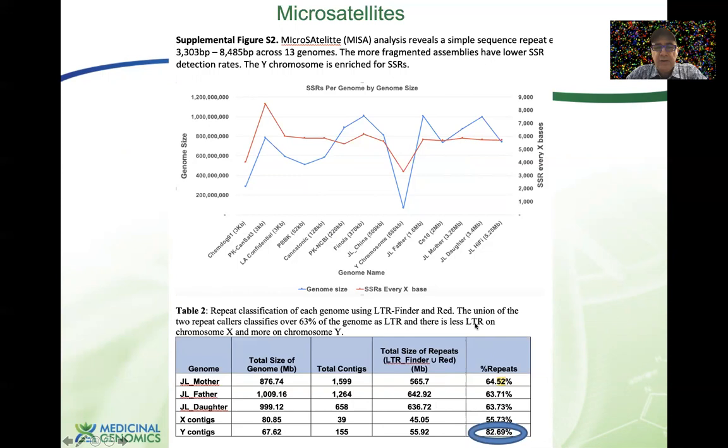And when we look at the references, these seem to be where all the breakpoints are. Most of the terminal ends of the contigs are SSRs, very long ones that aren't getting put together in the assembly correctly. So we think we understand where all the gaps are, and we think we understand their structure as well.